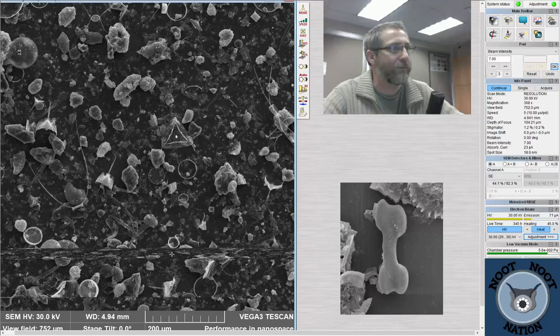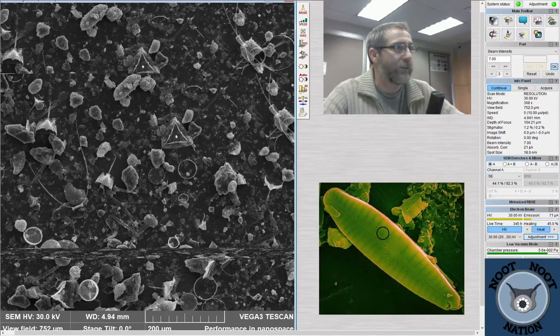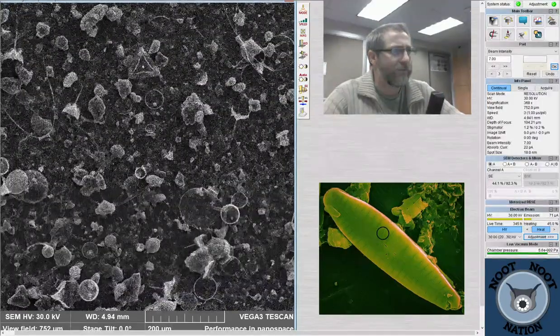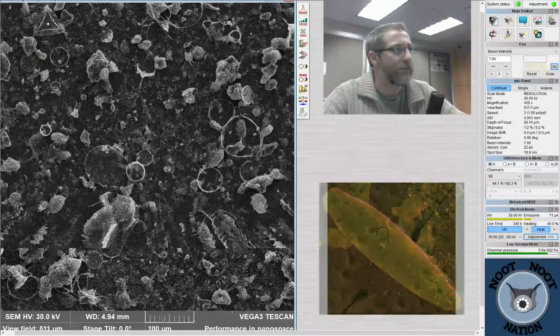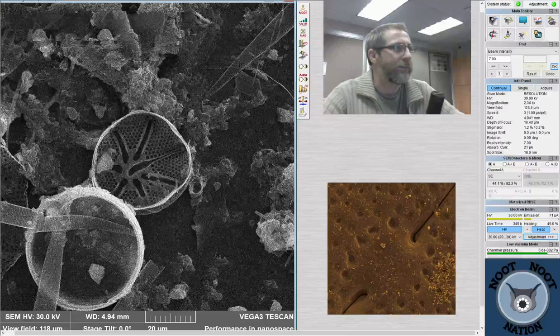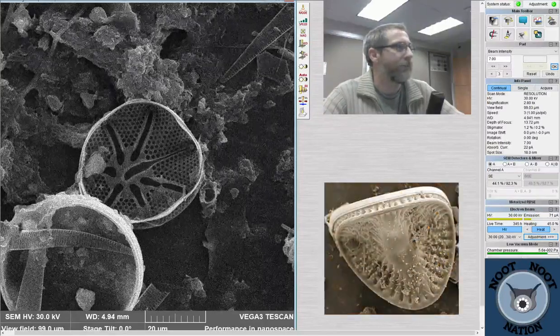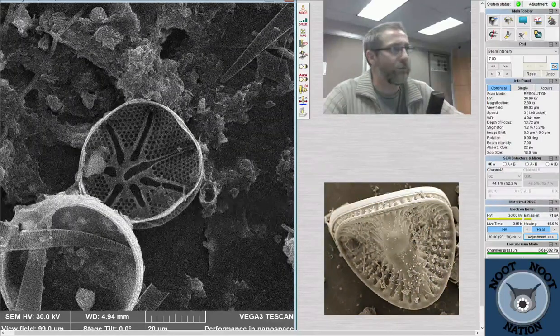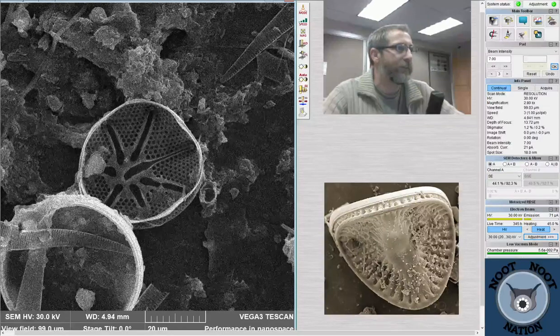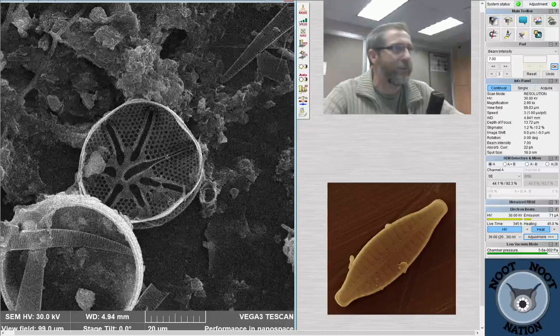Not all diatoms have perfect symmetry, although you'll probably have noticed by this point that a lot of them are symmetrical. I'm going to move it to the center of our field of view and zoom in on it so that we can kind of see it. So it has some symmetry. You could basically put a mirror plane through this field of view, and then these pieces are mirrored around that, but you don't have this thing also pointed that way, right?